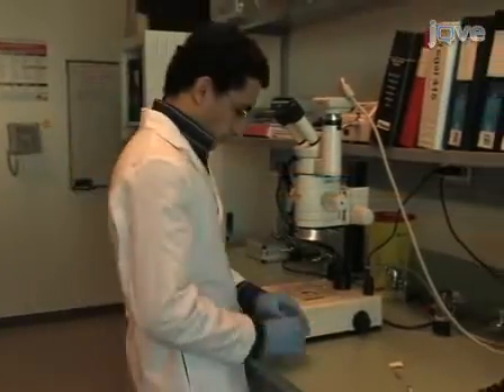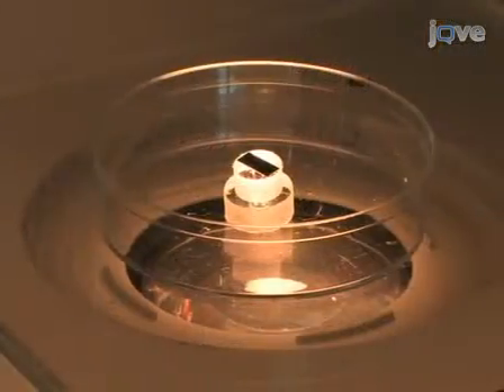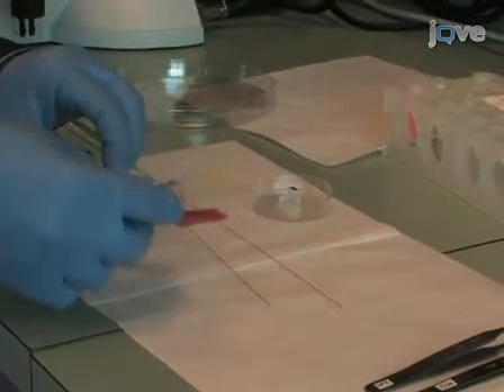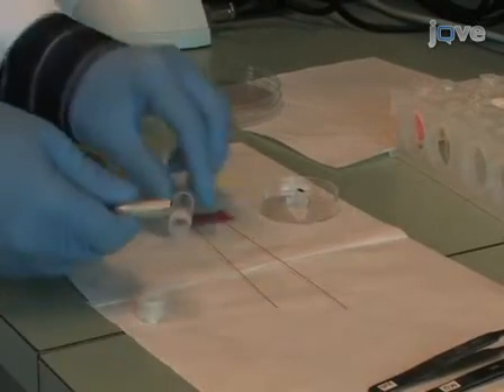The MFP chip is prefilled with buffer solution to prevent the trapping of bubbles when connecting the capillaries. Finally, the capillaries are plugged into the PDMS connection piece in the microfabricated probe head.